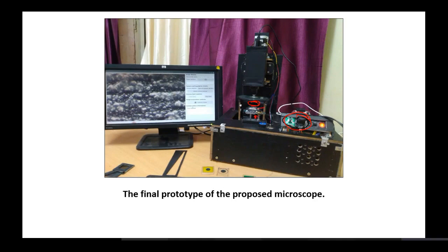If you see some bright spot, that is it, and just over here we have the filter holders. See this image. This image is giving a 3D perception. Here we have applied the oblique illumination filter.